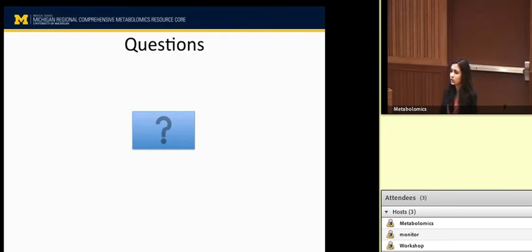So we can use that class information, and obviously retention time also. Each class has a different retention time. Some classes share retention time, but they elute at different retention times. So class based or retention time based, mostly class based here in lipidomics.